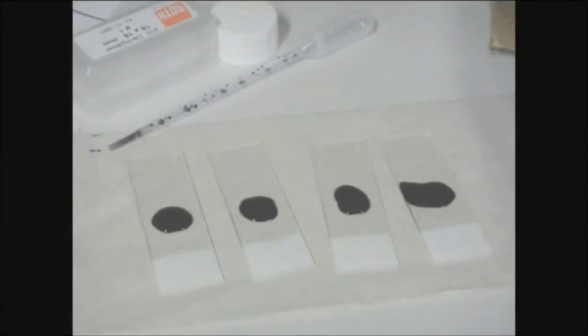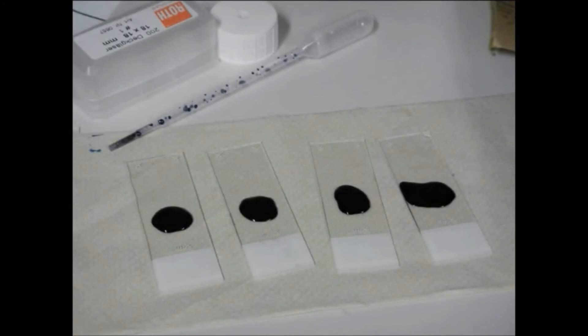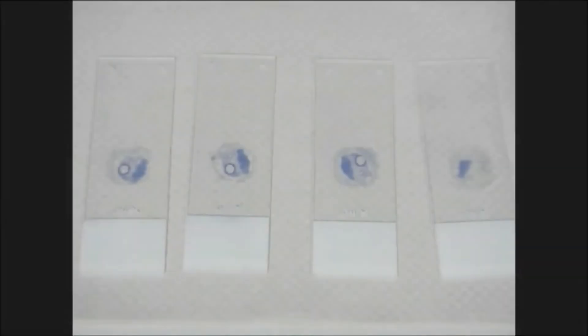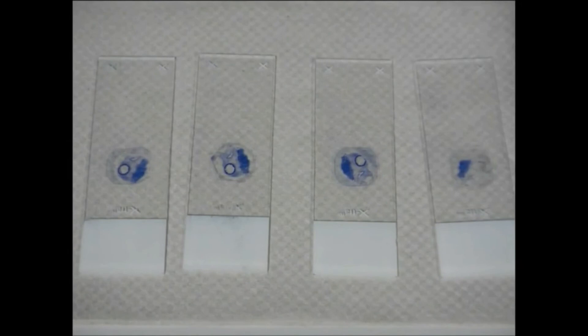Several methods for staining embedded sections have been established for use here. Sanderson's Rapid Stain has, for example, proven suitable for the fast staining of samples. For an H&E stain, the section must first be deplastified.